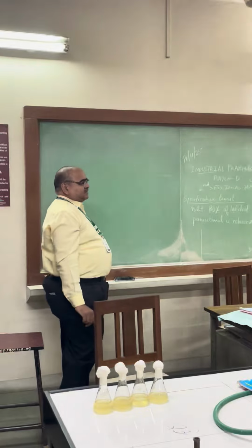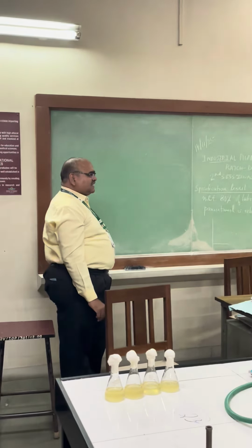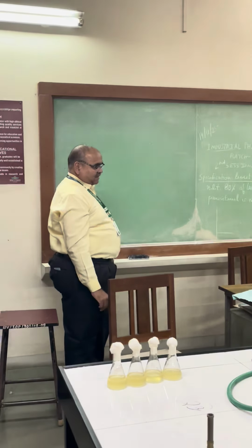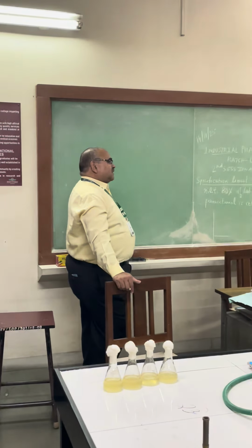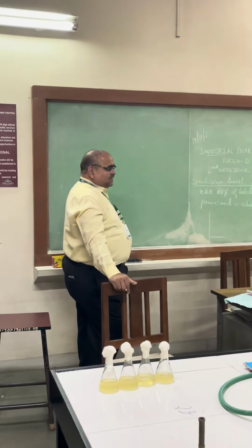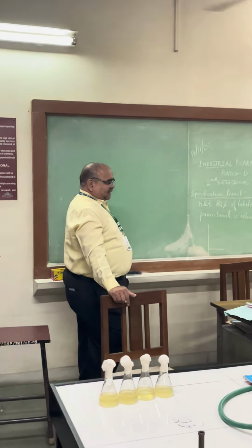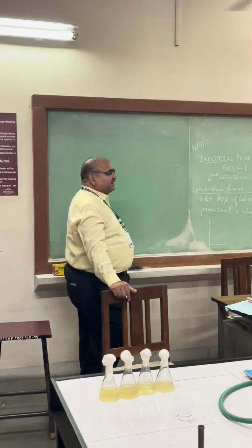Now this amylase you have studied in a previous year, that is first year semester 2. One subject, the name of the subject is biochemistry. In biochemistry, in the lab, that is biochemistry practical, you have studied qualitative analysis of carbohydrates. In that qualitative analysis of carbohydrates, there are 8 to 9 different tests.